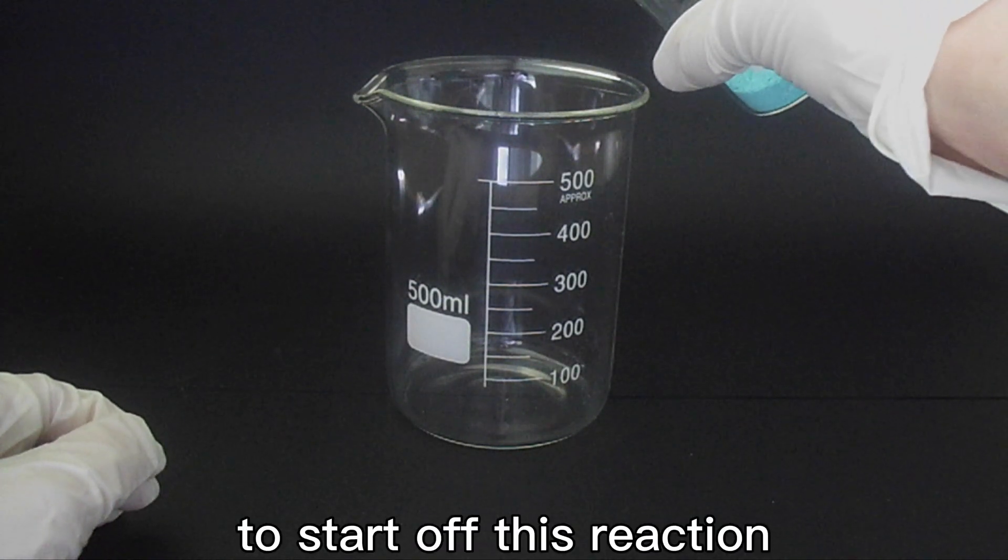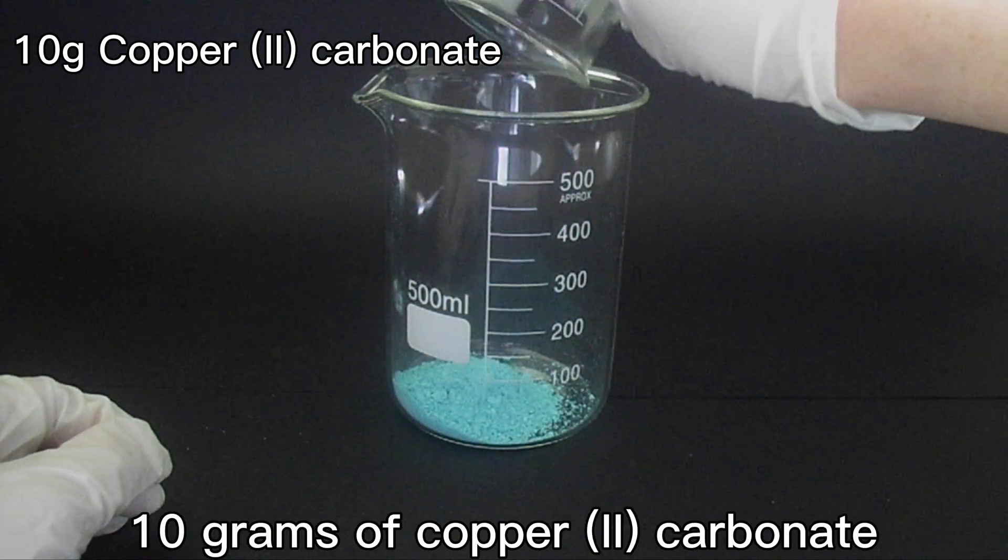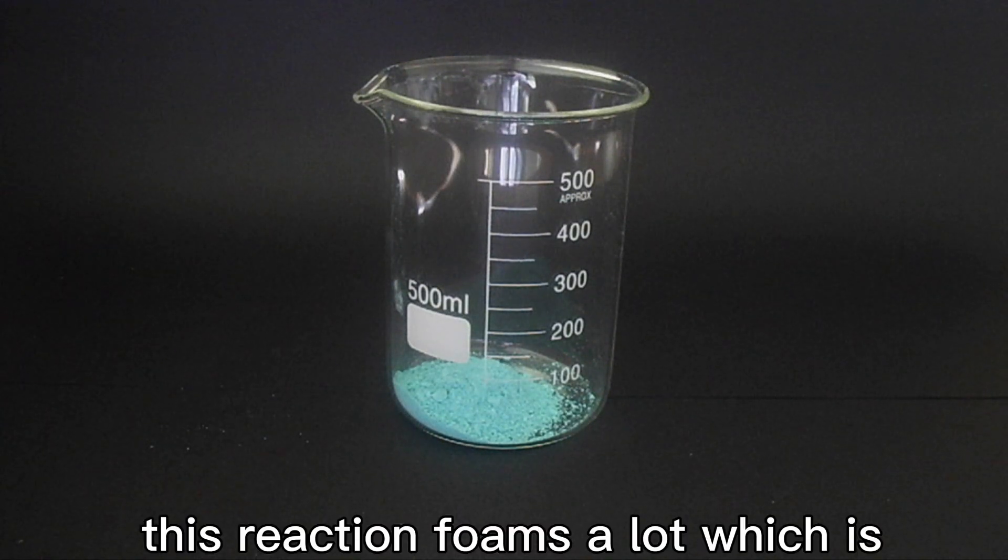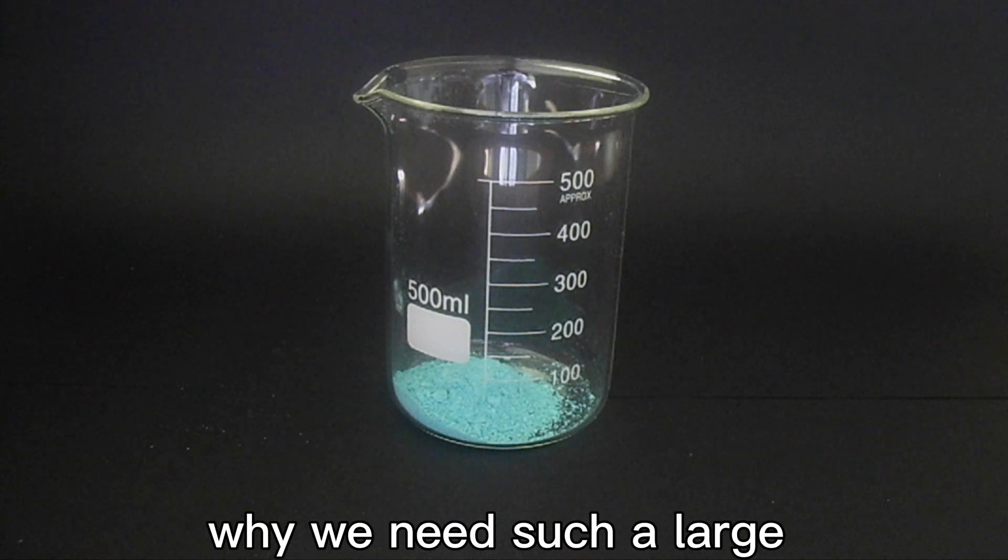To start off this reaction, we first need to weigh out 10 grams of copper-2-carbonate and add that to a 500 ml beaker. This reaction foams a lot, which is why we need such a large reaction vessel.